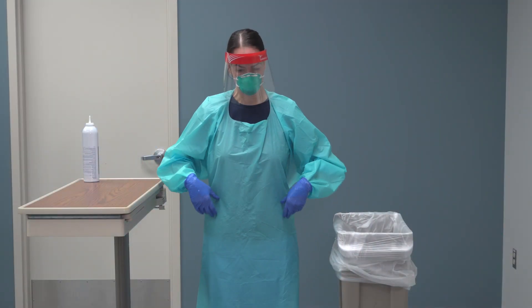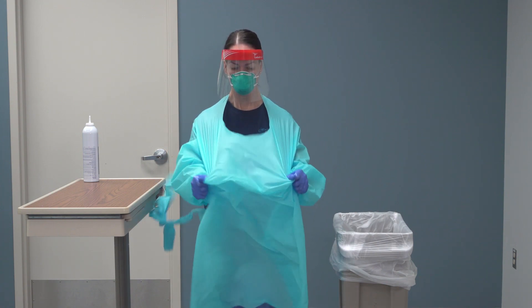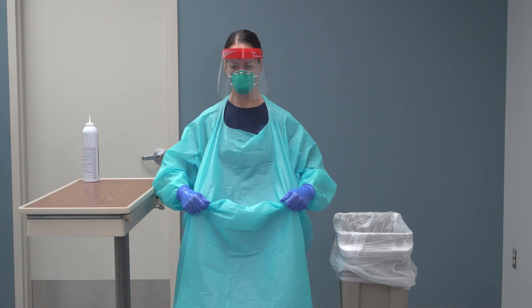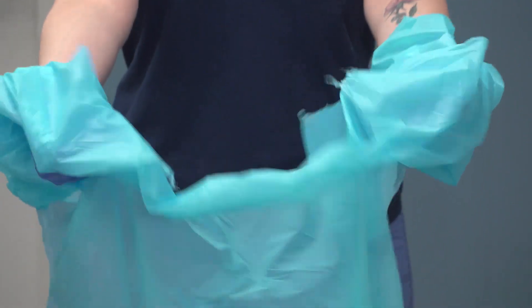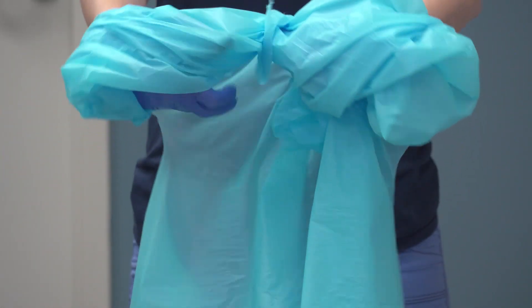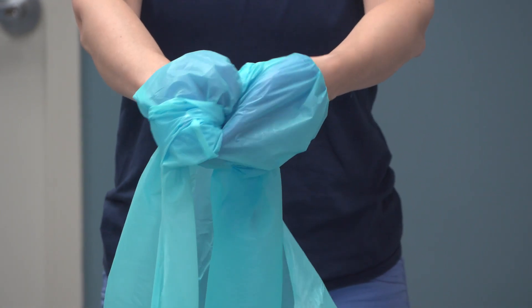Remove blue isolation gown and gloves while in the patient room. Grasp the waterproof gown in the front and pull away from your body so that the ties break, touching the outside of gown only with gloved hands. While removing the gown, fold and roll the contaminated gown inside out into a bundle.